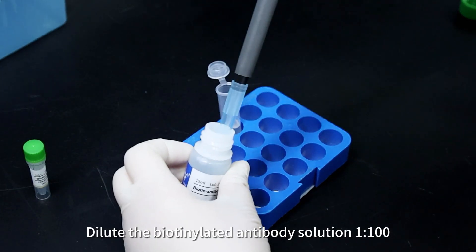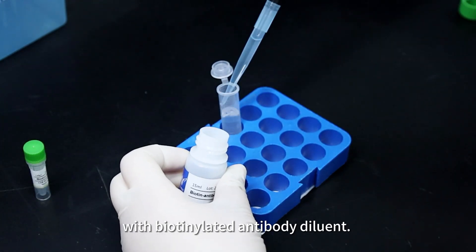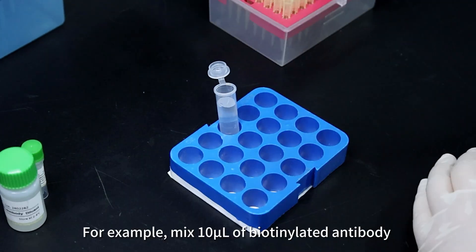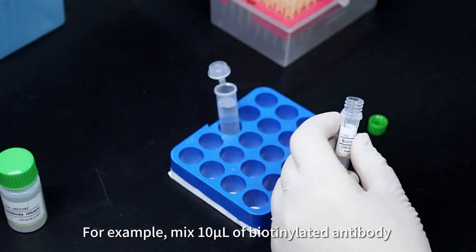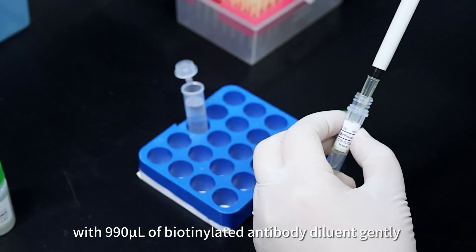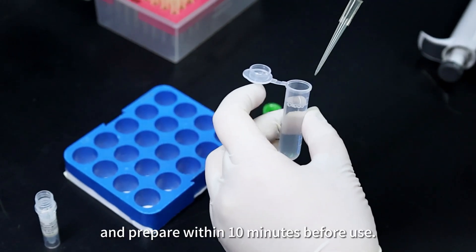Dilute the biotinylated antibody solution 1:100 with biotinylated antibody diluent. For example, mix 10 µL of biotinylated antibody with 990 µL of biotinylated antibody diluent gently, and prepare within 10 minutes before use.